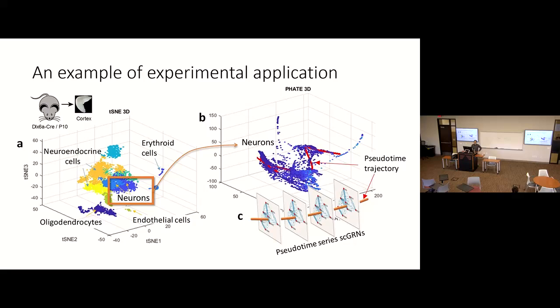So this is a real example illustration. We have mouse data. If you extract the neurons and build the trajectories, this could be neurons in the different layers of the brain, okay? So this may not be a pseudo time. It could be the anatomic structure of the different layers of the brain, with different subtypes of neurons.